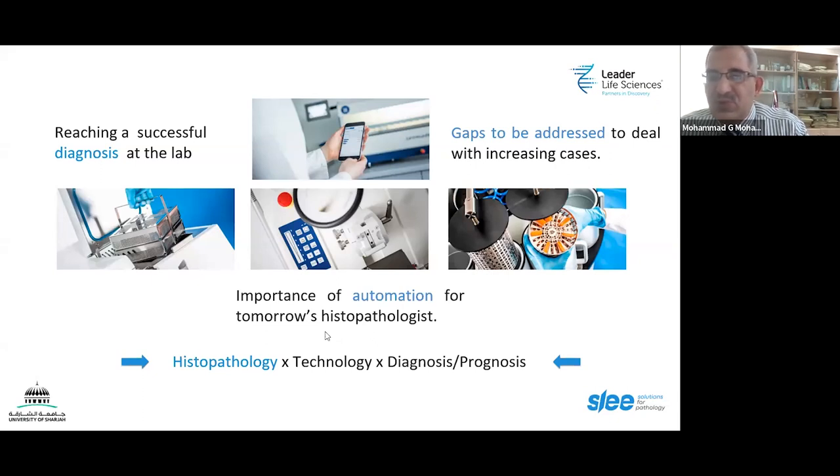For example, the microtome is required to produce consistent thickness of the sections, maybe consistently 3 micrometers thickness. We don't want to have, for example, a section that is half 5 micrometers and half 10 micrometers, or alternatively one section is thick, one section is thin. So here comes the automation or the machine stability to support this process and make it easy.